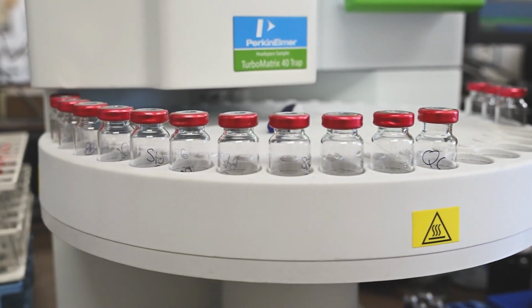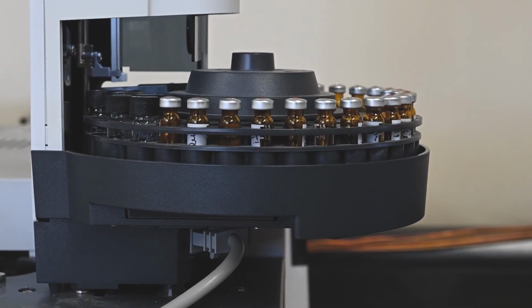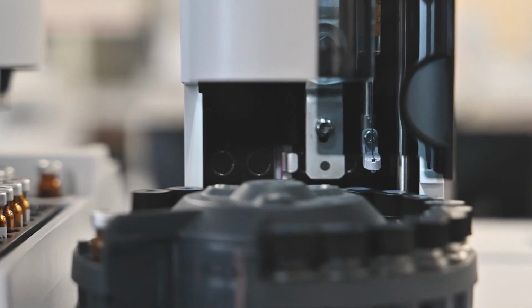If there's an odour associated with it, such as a solvent odour, then we might do some headspace GCMS analysis looking for the solvents. We will do a solvent extract and then a GCMS scan looking at our semi-volatiles. So we're looking at pharmaceuticals, oils, phthalates, additives, things like that.